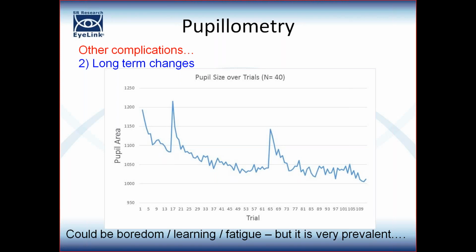Then we have a little break, and then there's a screen that says, okay, and now the experiment's going to begin. And oops, up pupil size goes again, and again descends pretty rapidly over the next few trials, but then continues to get even smaller till the end of the block, where it bounces back, but not quite to the same levels as the first break, and again quickly descends and then shows this more gradual descent.